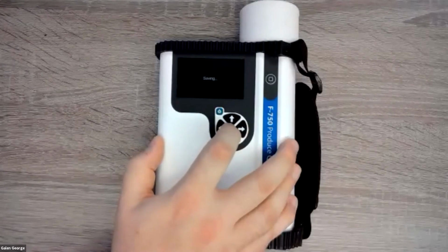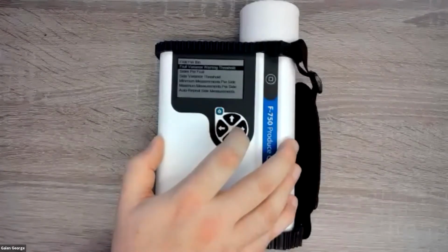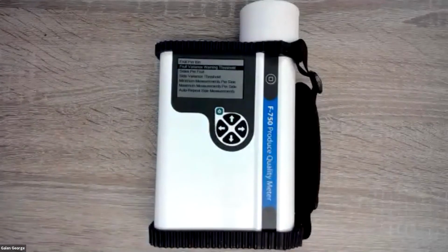And so then the next time you go to scan a fruit, if it gives you a more than 5% different average than the average of the bin, it'll actually pop up with a warning that says, this fruit is different than the other fruit by at least 5%. So at that point, you either would want to maybe scan a different fruit or re-scan that same fruit to make sure something didn't go wrong with your scan. And then at that point, you would want to make a decision to say, is this a fruit that I want to include in this sampling batch or not?